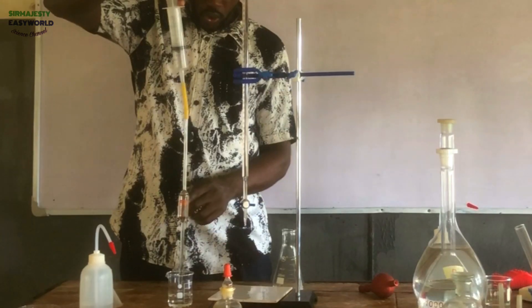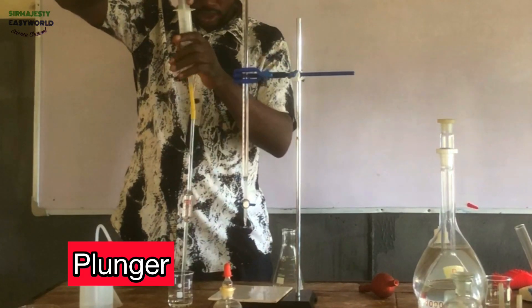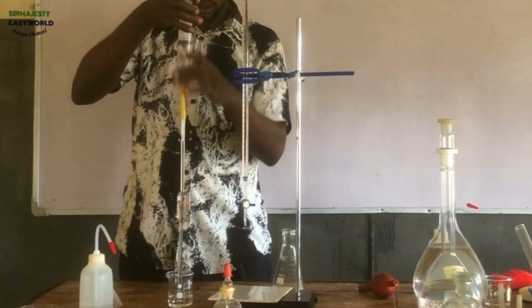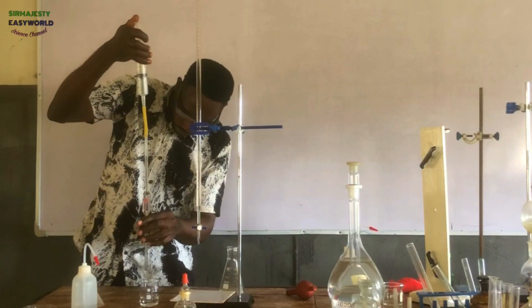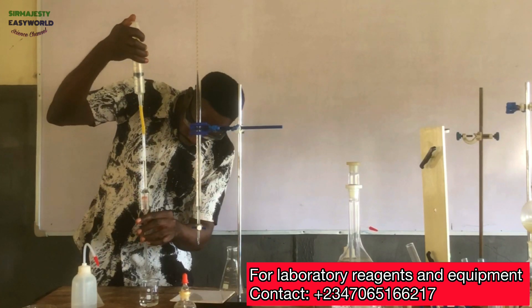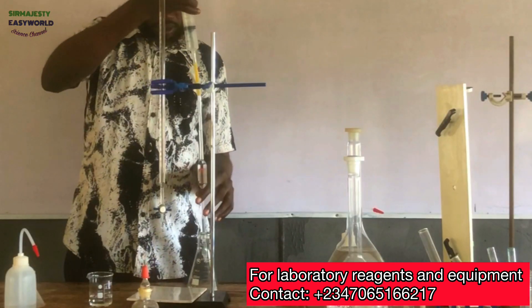The way it works — just pull the piston, the syringe draws the water, then when you push it down, it expels. Pulling it up siphons, then pushing it down expels or dispenses to the level you want. So do not go gastrin — it's a special one I advise, and it's available for sale.